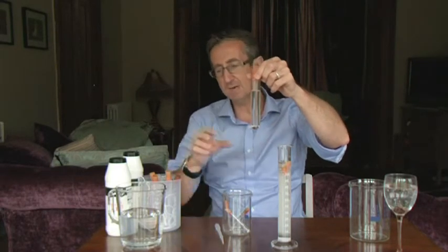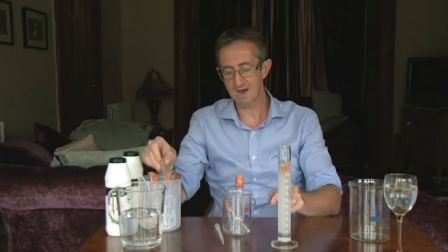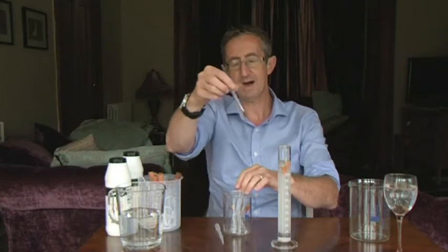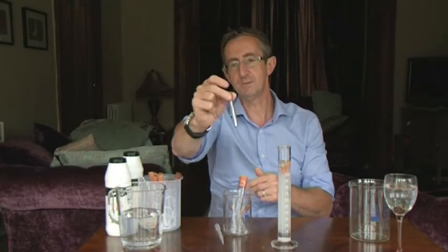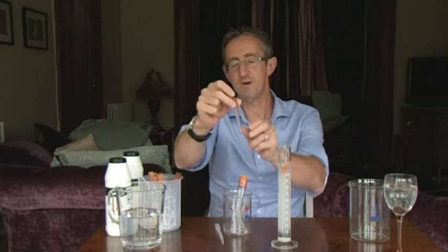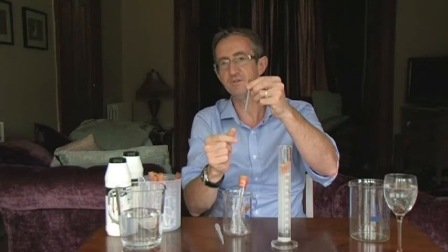It's quite a complicated setup, and I tried it with these test tubes, but I found I had to buy some of these, but they're quite cheap. So you might need to purchase some very small ones and some very small bungs to go in the end, because it's just much easier for the students.